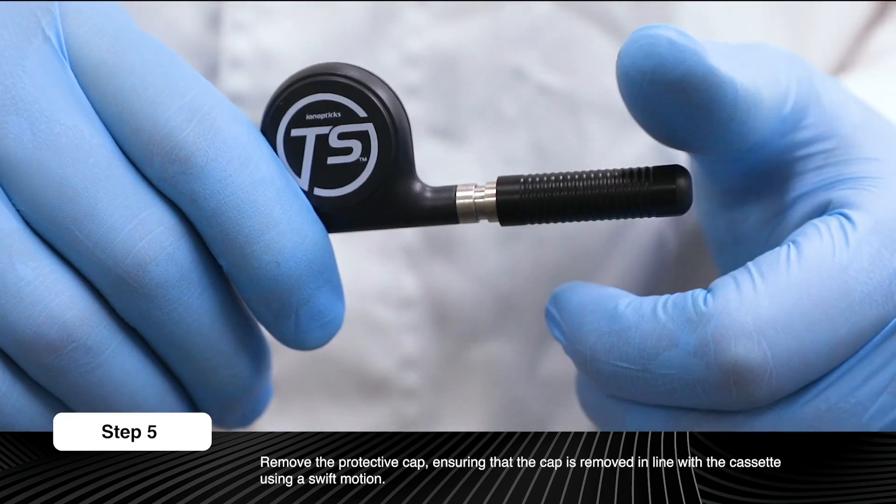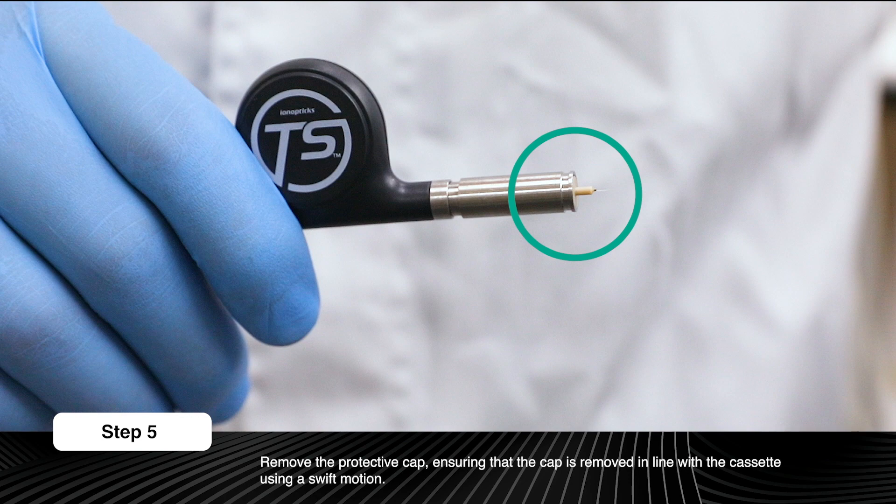Remove the protective cap. The emitter is not protected by a sheath and protrudes from the end of the cassette. To avoid damaging the emitter, ensure that the cap is removed in line with the cassette, using a swift motion to completely separate the cap and the cassette.